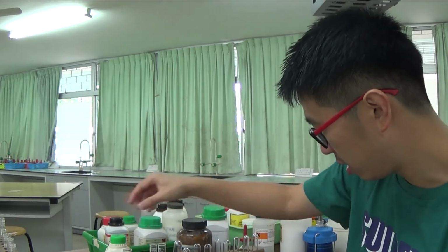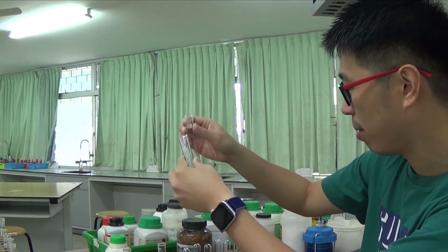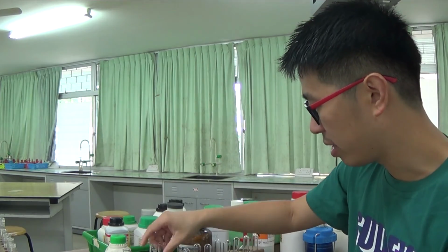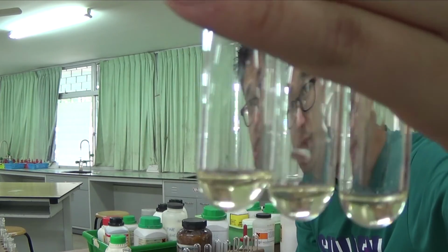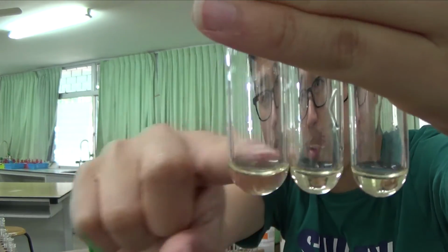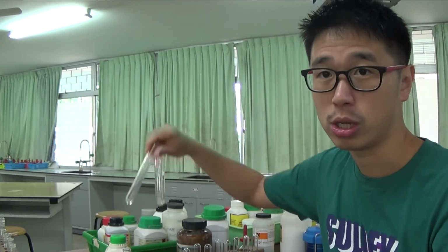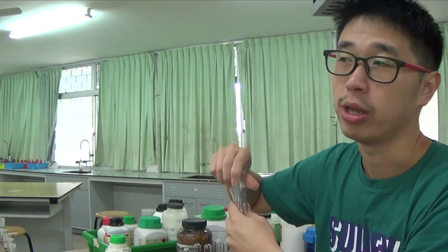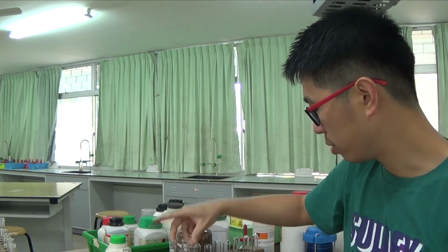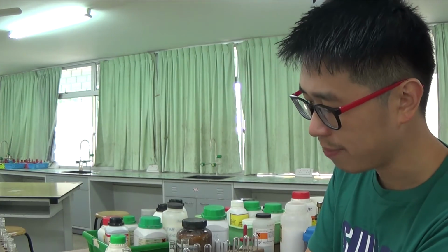Realistically speaking, I need to divide it into another portion so that we can test with ammonia. Usually you'll be given a lot more solution than this. This is actually less than 1 cm cube. 1 cm cube is around that much, so I'm just using half the volume, which usually you will use a bit more. But when you have a lot more of the solution in the test tubes, you will need a lot more of it for it to have an equal amount before you add in excess. So let's try sodium hydroxide first, okay?